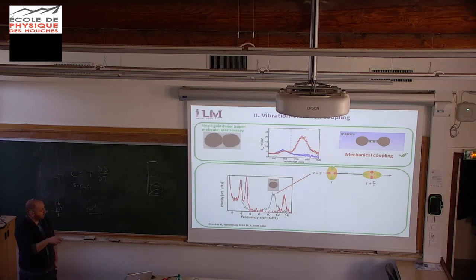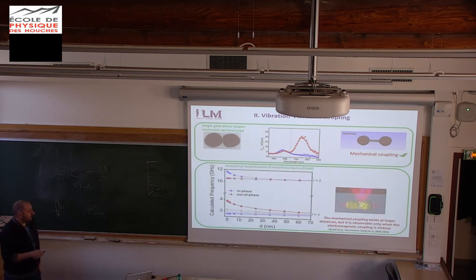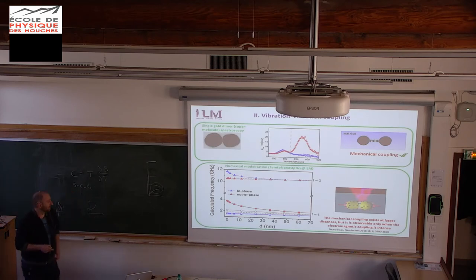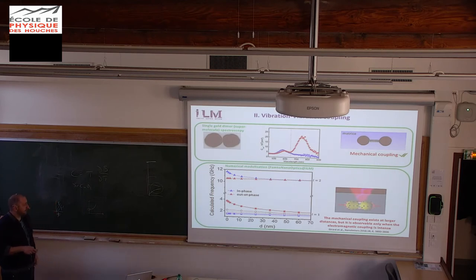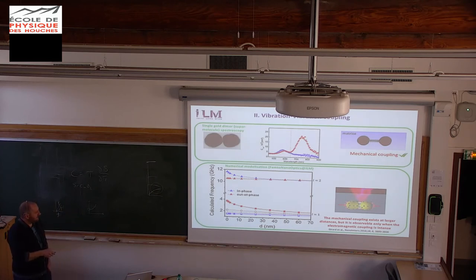Here I compare with a single nanoparticle case, and you see there is a shift of these vibrational quadrupolar modes, and this is also due to the hybridization of the vibration. So this was my experimental result, so I asked my colleagues for modelization to understand what happened. This was done by Aurélien, and we just look at this effect on the quadrupolar mode, and this is the L equal 1 mode coupled. And you see that as the distance decreases, you have a strong acoustic hybridization.